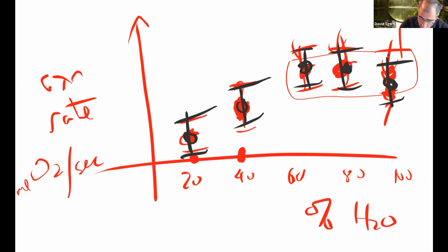So if you went down, that doesn't make me think something is horribly wrong. It's probably within the margin of error, and it still supports that we're at some kind of saturation if it's not speeding up and they're relatively close to each other up there, rather than increasing as we increase the concentration of the substrate.